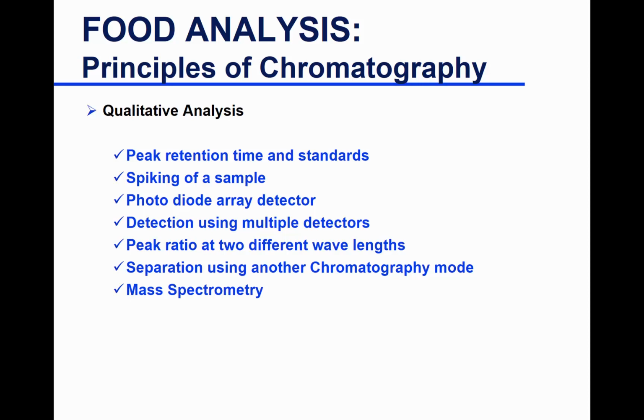What else? Maybe looking at the overall shape and how many peaks there are. Okay, how many peaks there are? That means how many compounds do I have? Yes, so how many different compounds do I have in the sample when I extract with solvent X? Yes, good. And then to see if it is there. What else? Yes. Thank you. That's the thing I was looking for. Yes, to identify. So sometimes it's just running and trying to identify what there is. Not necessarily quantitate, just to try to see what kind of pesticide do I have in my sample? What kind of phytochemical do I have in my sample?